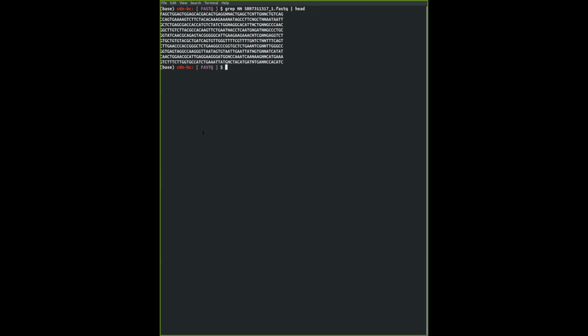We can also do some sort of counting of the number of lines or the number of characters in this grabbed output, or pattern-matched output. One way is wc, short for word count, and there are several flags. I'm going to use the -l flag, so hyphen followed by L. This counts only the lines in this output and not characters.